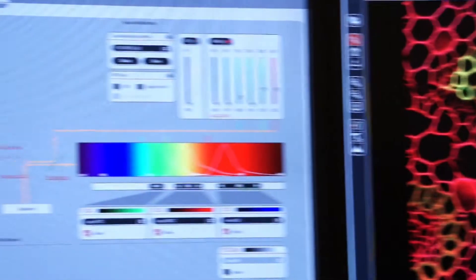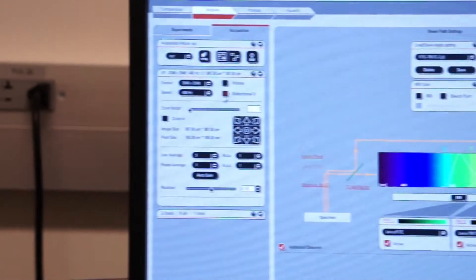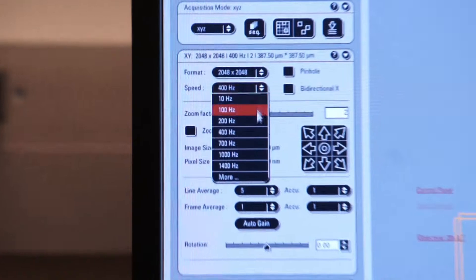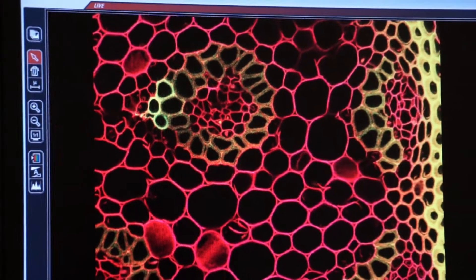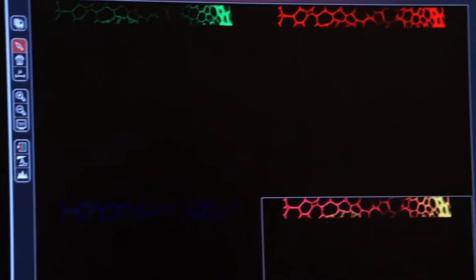Well, I can go back over to my speed pulldown menu and let's say I want to increase it to 700 hertz. So now I'm going to capture my image. We'll watch it again. And this should prove to be a little faster than it was last time.